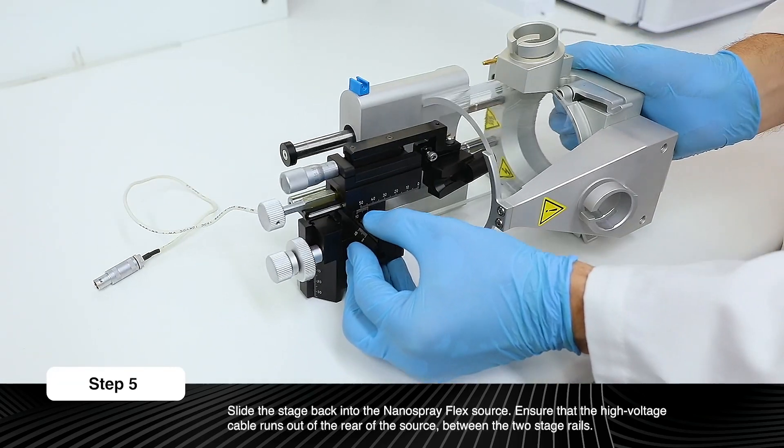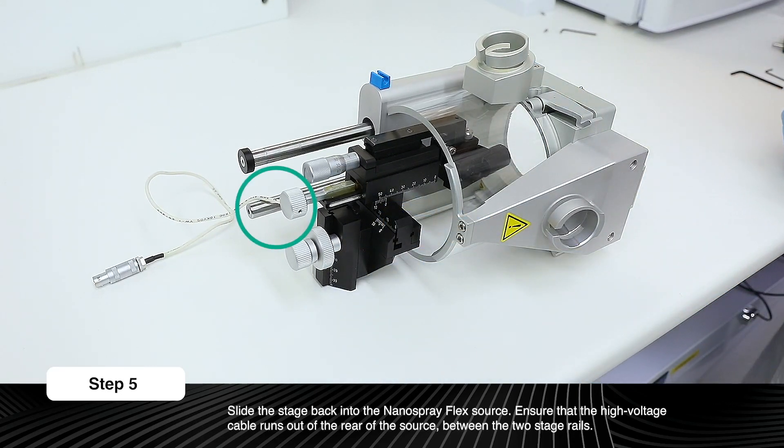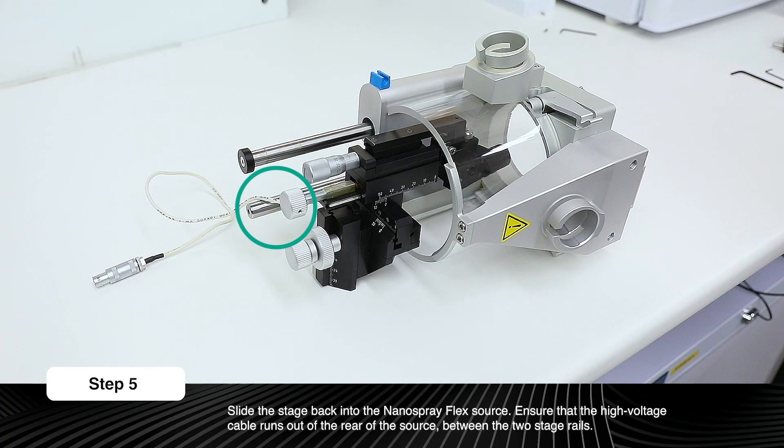Slide the stage back into the Nanospray Flex Source. Ensure that the high voltage cable runs out of the rear of the source between the two stage rails. The high voltage cable should not pass between the source mount and the stage.